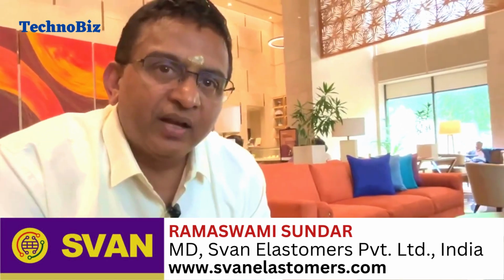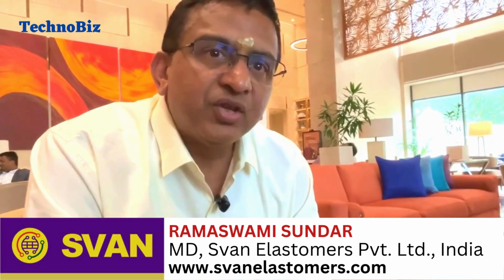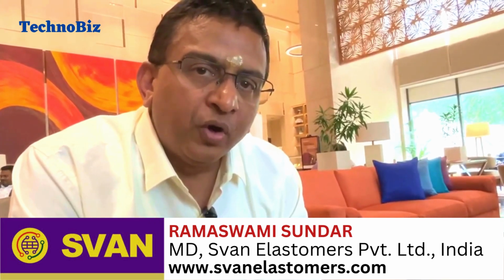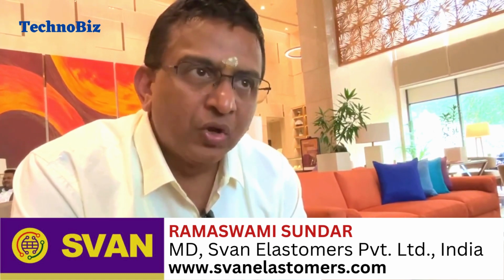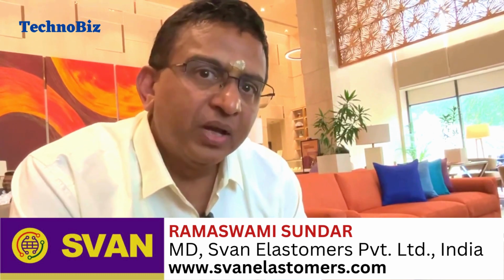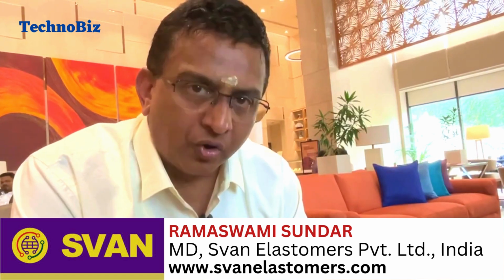This is called, in industry parlance, optimum cure time. Because of the nature of the curve, it is almost impossible for any compound to get to 100. There's nothing like TC 100 because it takes infinite time. Or actually, after some time you get into reversion, which I will come to a little later. So TC 90 is considered to be the optimal cure time.